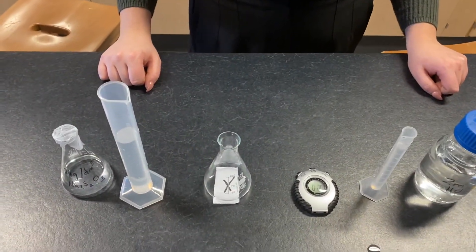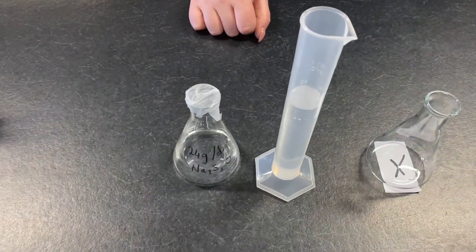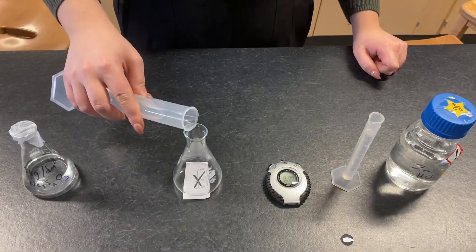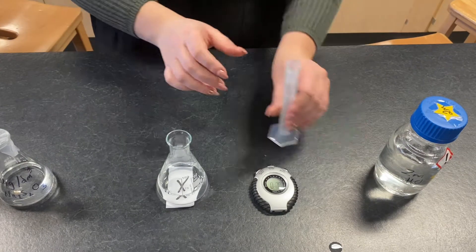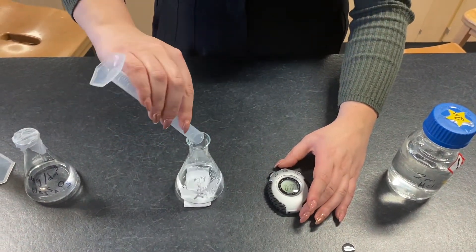Now we're going to repeat the experiment with 24 grams per decimetre cubed of sodium thiosulfate. We're going to pour our thiosulfate into the conical flask like before, and then we're going to have our stop clocks ready. When we pour our hydrochloric acid in, we're going to start our stop clock.